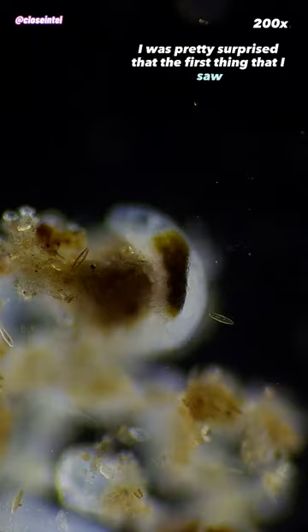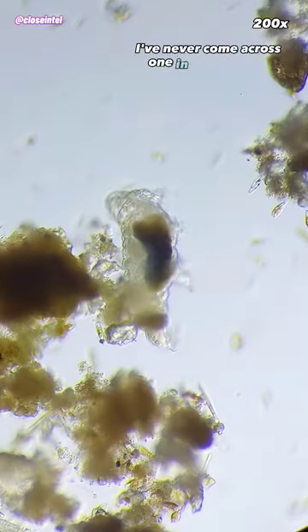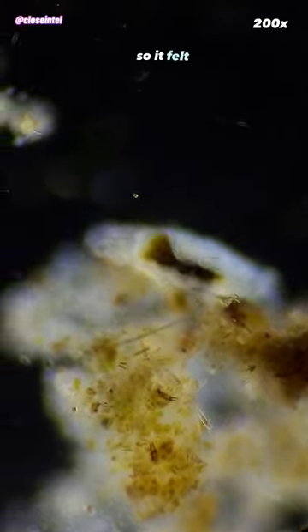I was pretty surprised that the first thing that I saw was this huge water bear climbing around some of the algae. I've never come across one in creek water before, and I get samples from this same creek all the time, so it felt lucky to catch this.